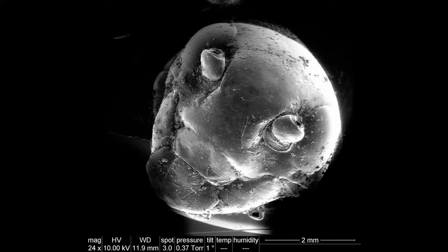These big features here, that's where his antennae were. They broke off, unfortunately, in the bag, but that's where the antennae would come out. And then probably one of the most well-known features are the eyes. Nicole is pointing to where the eye is right now. There's one eye here, then one eye over here. Those are pretty cool. I think we're going to zoom in on those first.